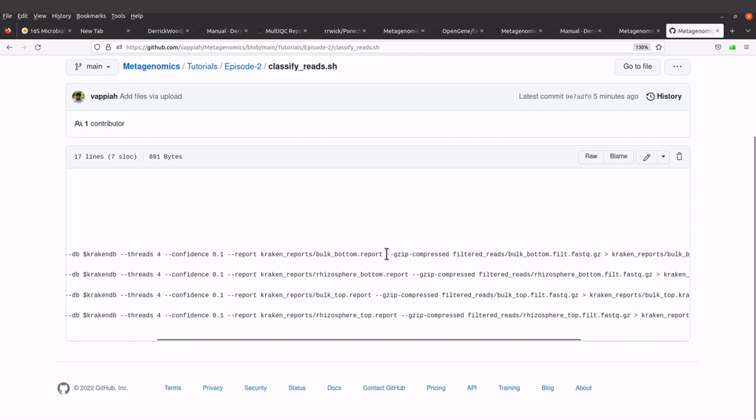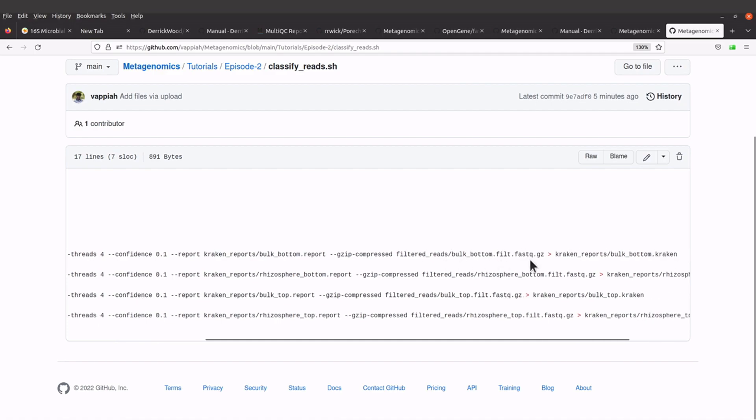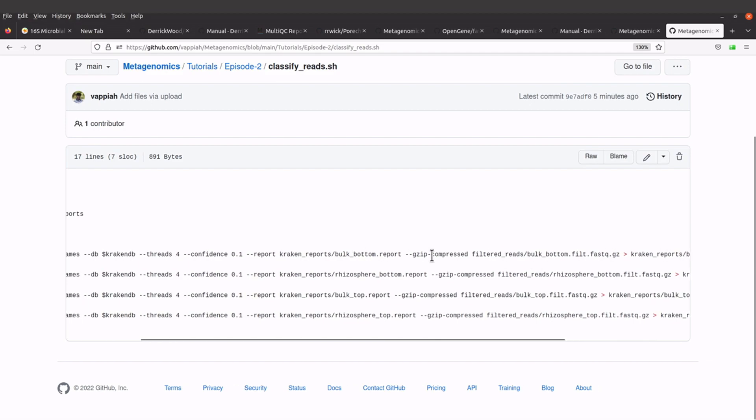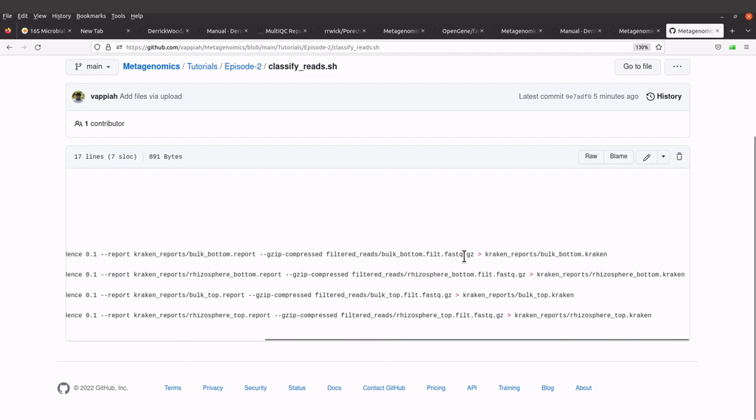We are using fastq.gz, which is compressed, so that's why we have this flag here. We save the output to the kraken_reports directory. For each file, we are going to generate two outputs: we have the reports and we also have this main file here.